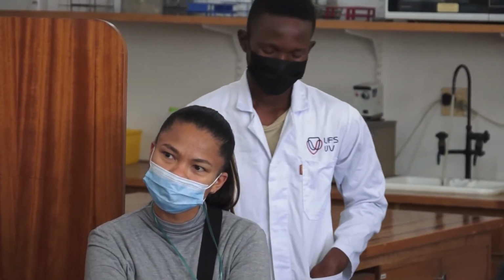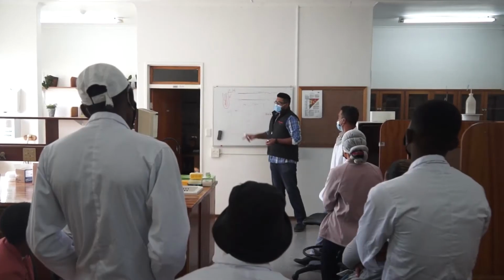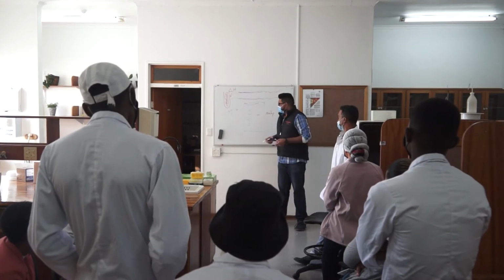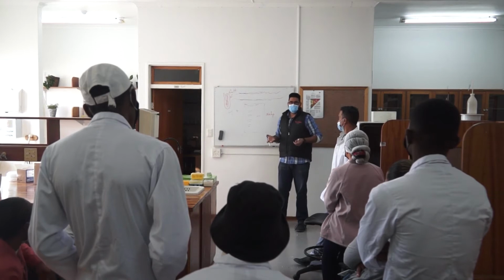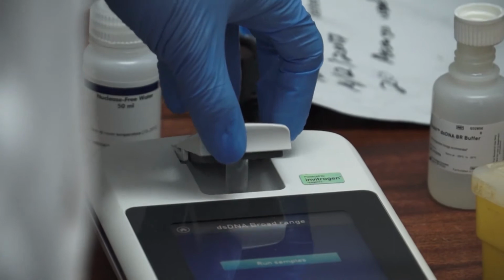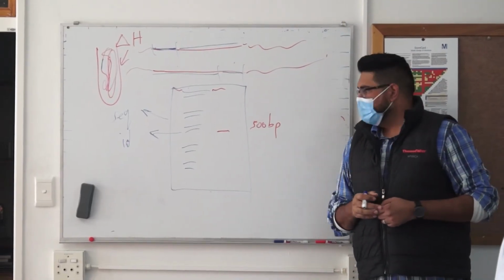So South Africa has a shortage of the necessary scientists who can perform this omics-based research. So anything that involves PCR, capillary electrophoresis, any transcriptomics, NGS, things that are supported by Thermo Fisher and also Diplomics, now to give future scientists the tools that are required and to obviously place them in a better position for any research that might be performed, and also put them on more of an even keel with the rest of the world that are further ahead with these kinds of technologies.